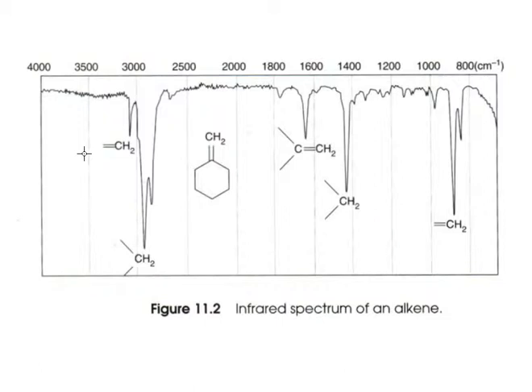If the change in polarity is large, then it is more likely that a photon will be absorbed, more likely that a photon will latch on to that bond. So that if we have a given bond whose change in polarity is large, we're going to see more photons absorbed by it, resulting in a larger peak. On the other hand, if we have an oscillating bond changing its polarity, but let's say the change in polarity is not large, it will still absorb photons, but will not absorb as many photons. The probability of absorption of a photon is less.